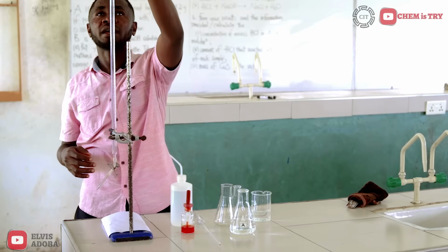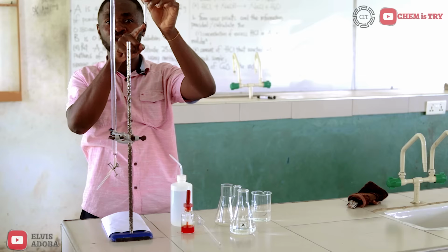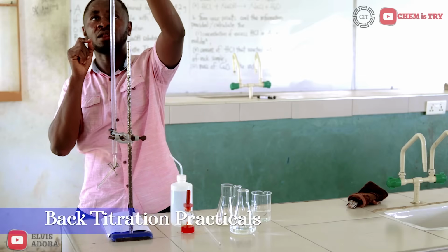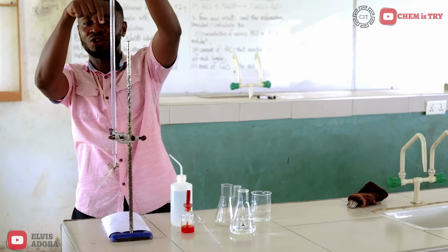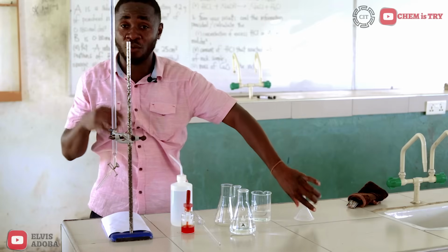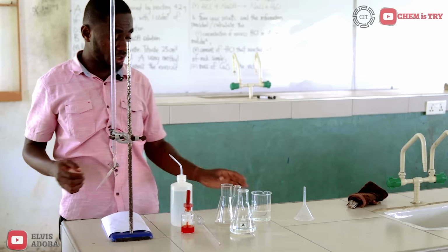I take off my funnel. Do you see some small drops over here? If I leave the funnel inside my burette and adjust my solution, these drops could add to the solution already in the burette and increase its volume. So I have to take it off before I adjust the volume of the solution in the burette.